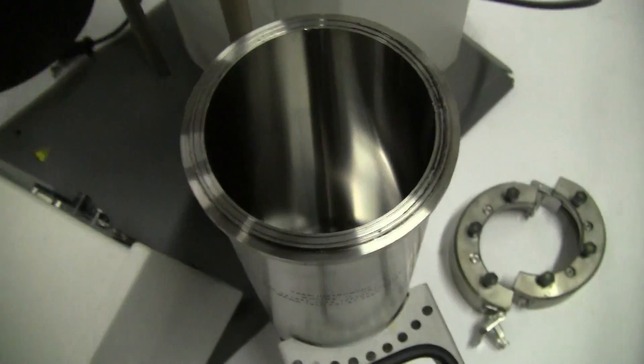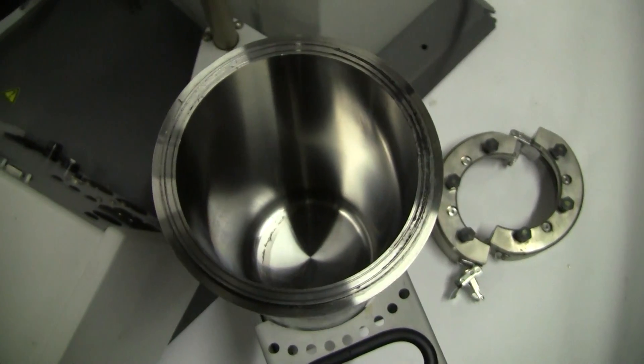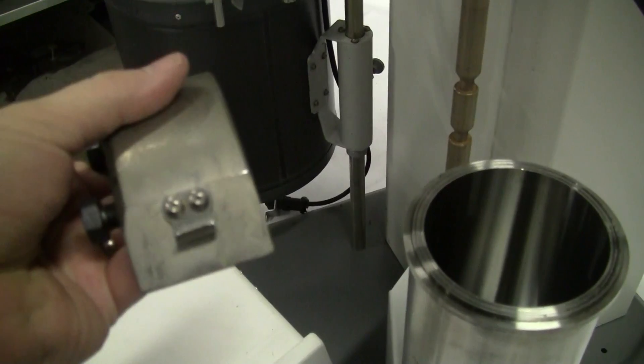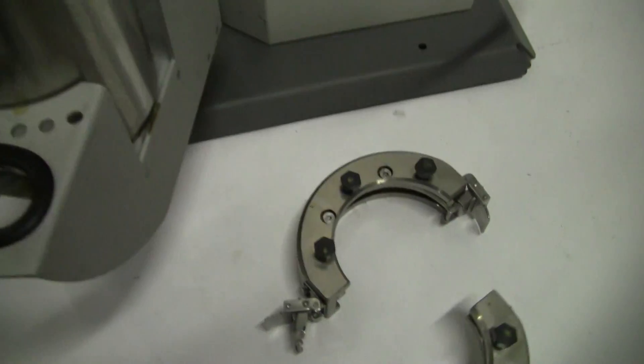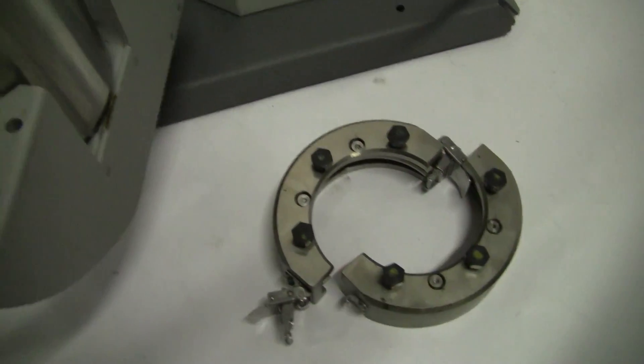Looking inside, very clean. This particular unit has the clamps on the outside for the head.